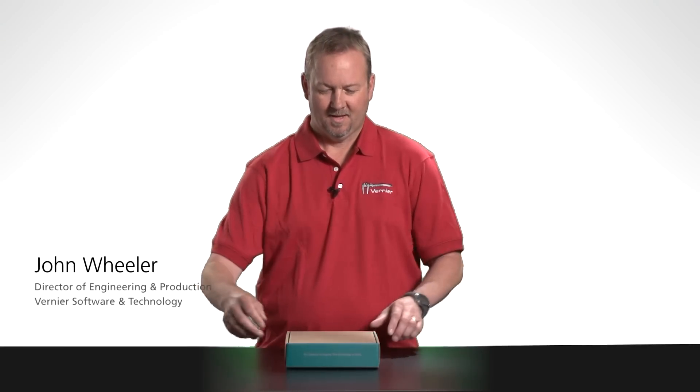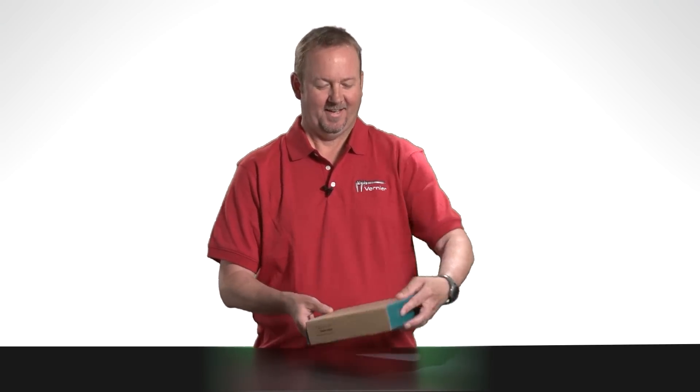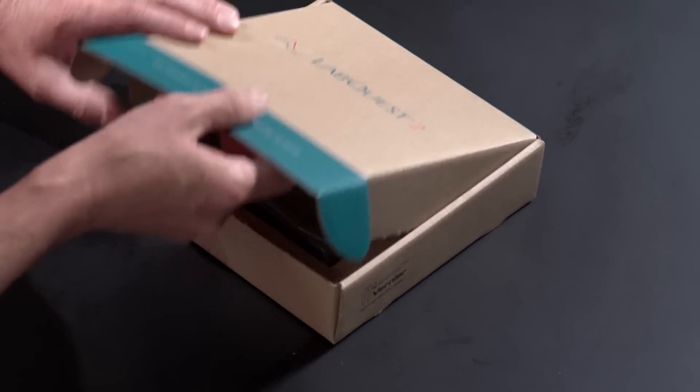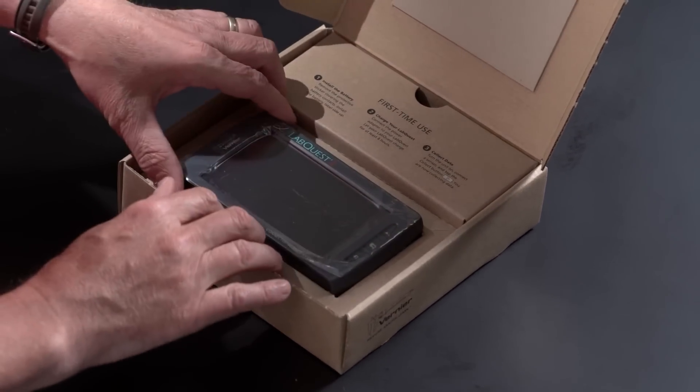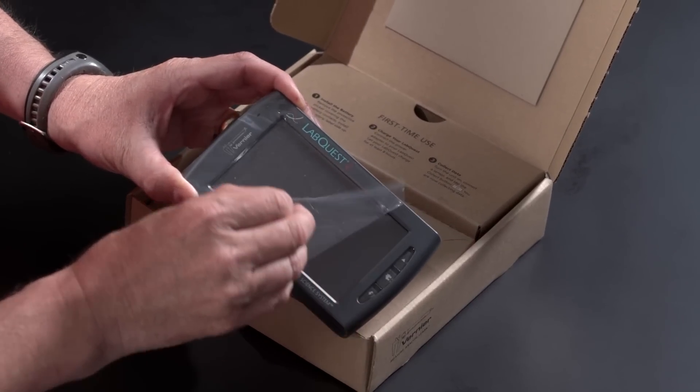I'd like to walk you through getting started with LabQuest 2. LabQuest comes in this eco-friendly packaging. First thing you want to do is open the box. Inside is LabQuest 2. You can remove it and remove the screen protector.